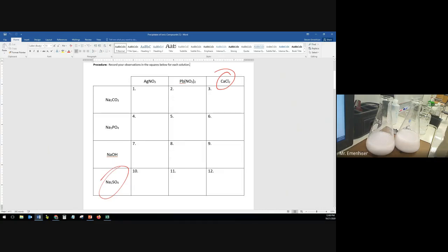Okay, so this should be pretty cool. I'm going to add some iodine solution, gram iodine solution, to this one. And I think we're going to see a yellow solid. That's what I'm hoping, but I'm not sure. Let's see what we get. Let's hope I don't hear a boom. Okay, no boom, but definitely cool looking. Let's let that mix and settle out. We get coffee.